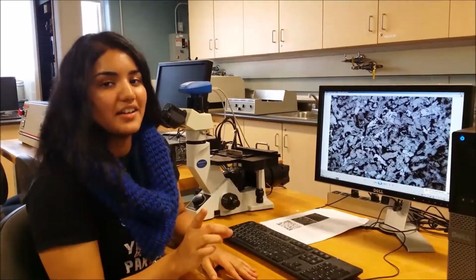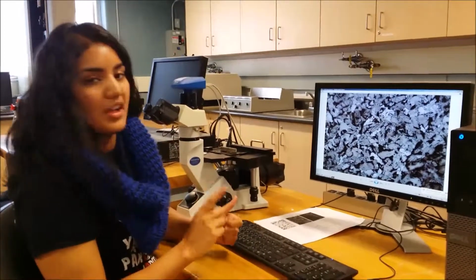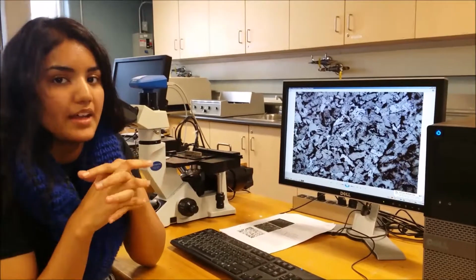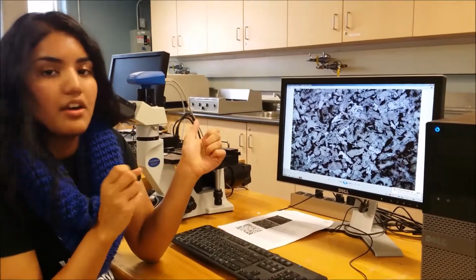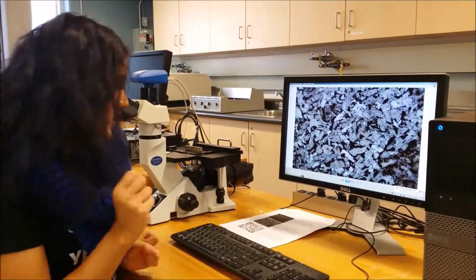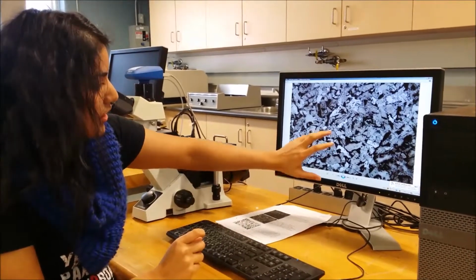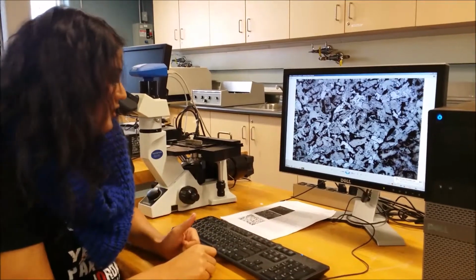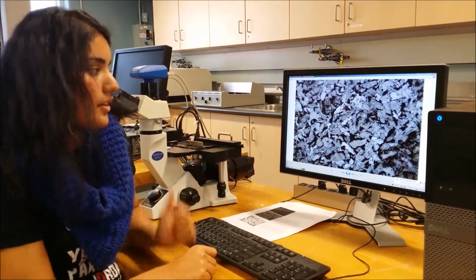So this part of the sample is the weld zone. You can tell it still has large grain size, but it is closely packed together, and it has a very hard hardness. And you can see a little bit of meshing of some other materials too, like sulfur, a little bit of white, and yeah, it is the hardest part.